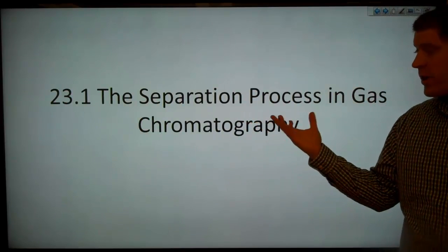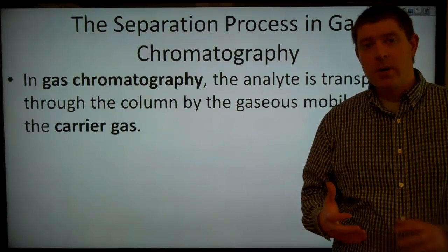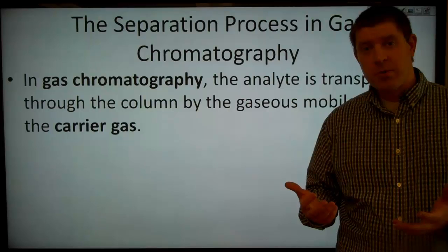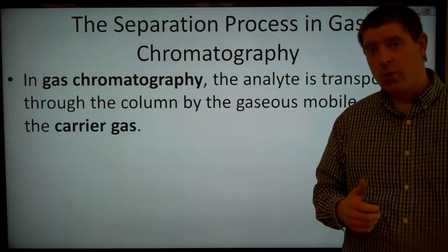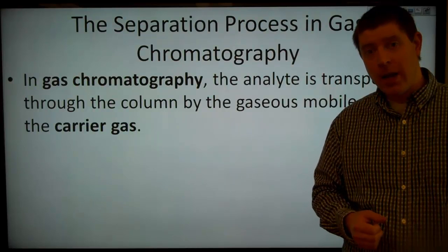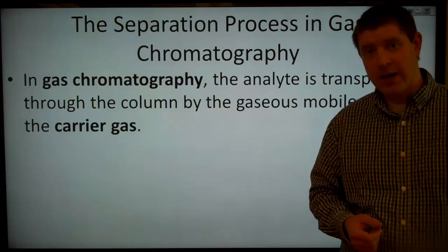Welcome to the separation process in gas chromatography. So we've already talked about chromatography or chromatographic separations in chapter 22. We've talked about the theory of it. So here we're going to talk about only those applications towards gas chromatography. And then in chapter 24, we're going to talk about the applications to liquid chromatography or high performance liquid chromatography, HPLC.